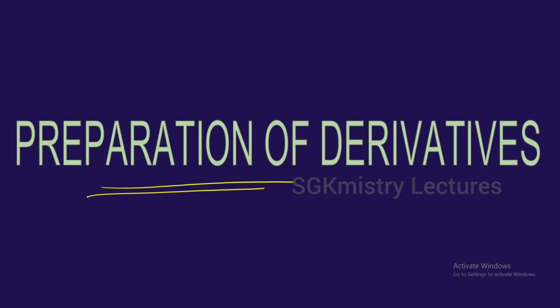So mainly when you're giving the report at the end, you're going to write the structure of the derivative also. So you need to know very clearly how to write the structure as well as the name of the derivative. So let us start with understanding how to prepare the derivative for these different compounds.